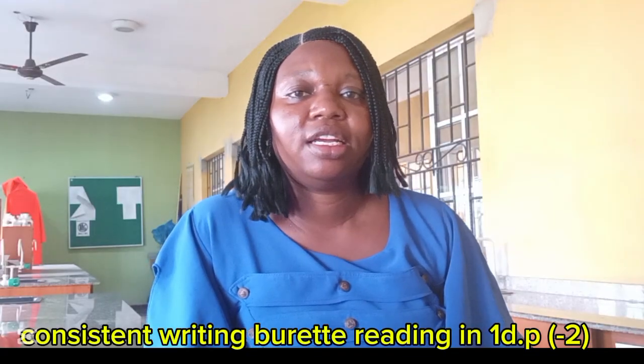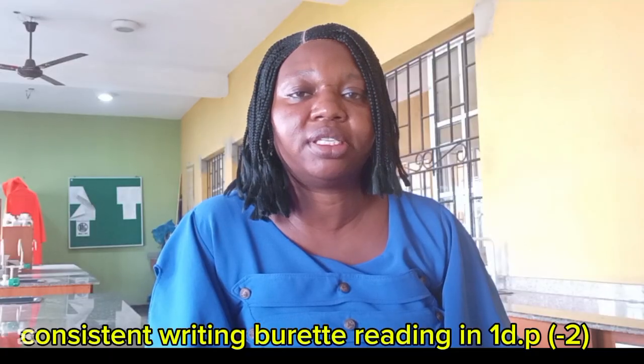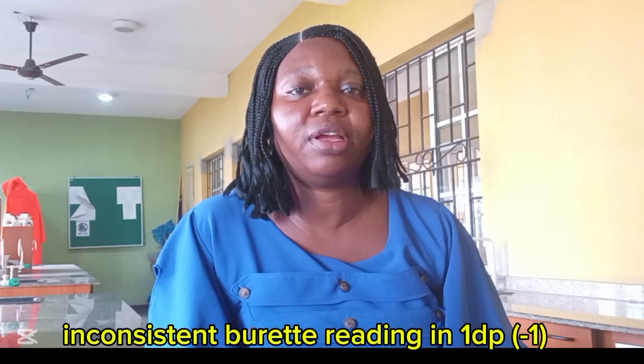We all know that burette readings are supposed to be in 2 decimal places. If you put yours in 1 decimal place, you will be penalized. But if it's only in 1 place where you mistakenly put 1 decimal place, you lose 1 mark. But if you have it in more than 2 places, you lose 2 marks maximum.